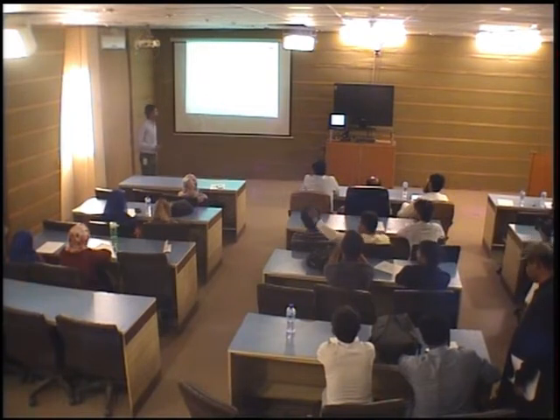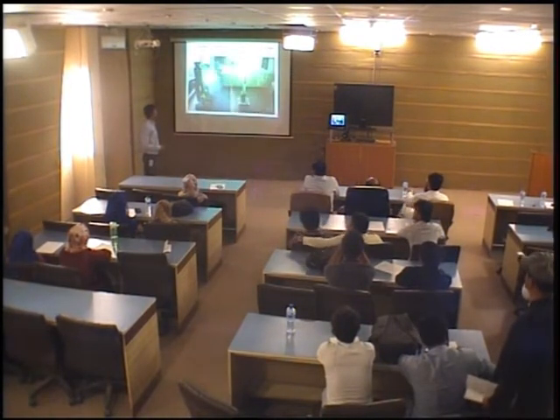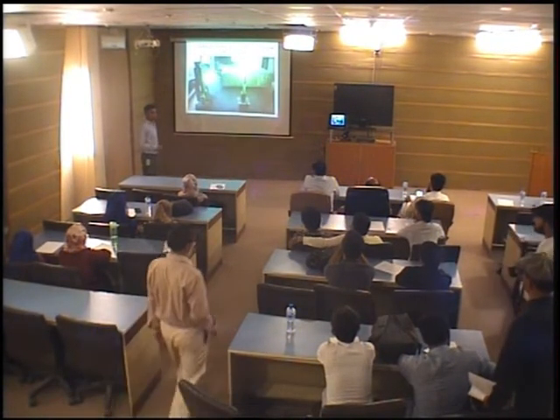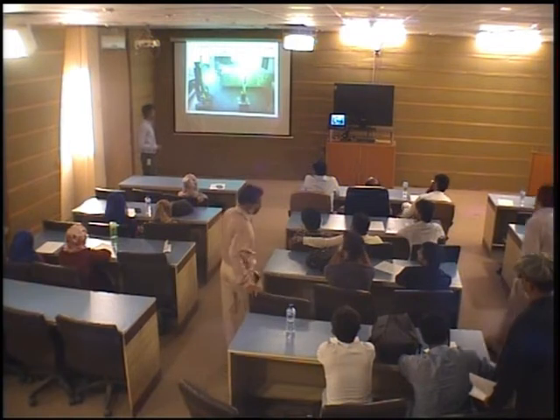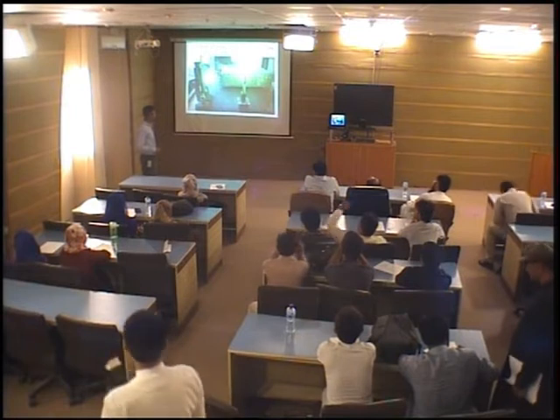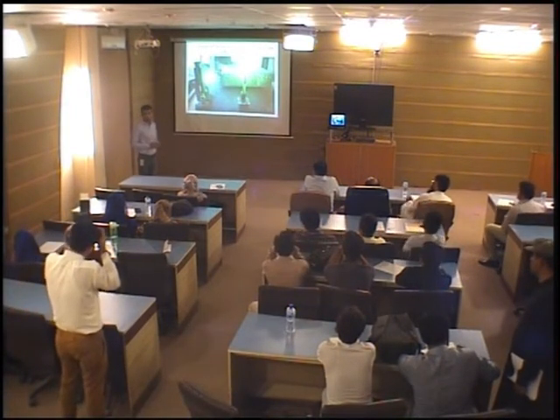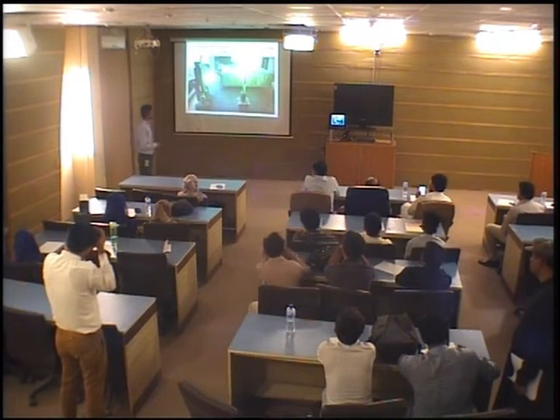Creation of plasma on cosmetic sample using LIBS technique. This figure basically shows the plasma, and this is our sample. When laser light comes from this side, after passing through the convex lens, it interacts with the sample. As a result, a plasma plume is generated normal to the sample surface, and this is the light of that plasma. And finally, we collect this light for analysis.